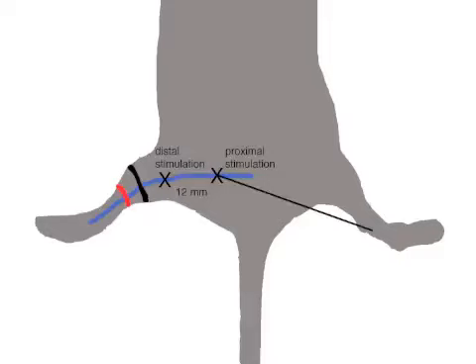The stimulation, using a needle electrode, is subsequently performed firstly at the proximal stimulation site and afterwards at the position of distal stimulation.